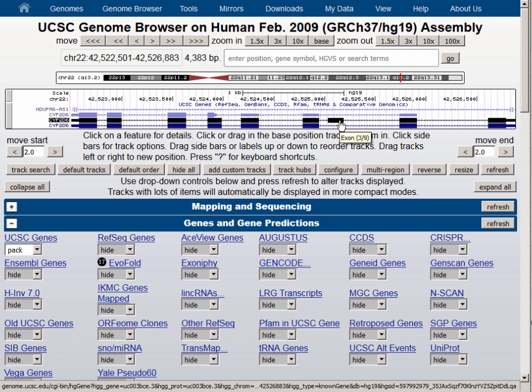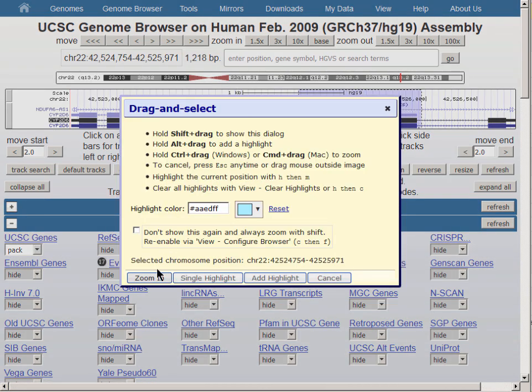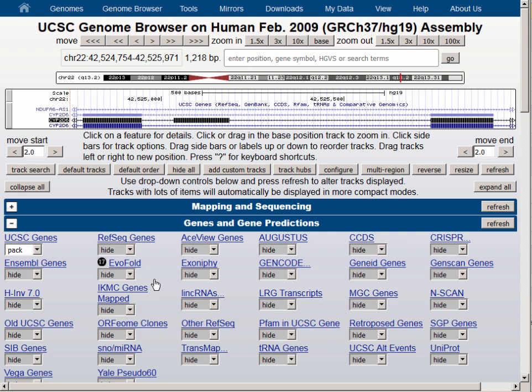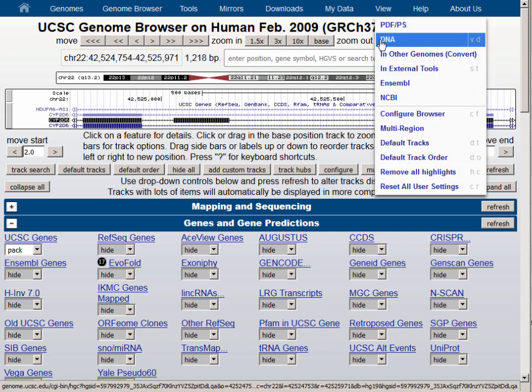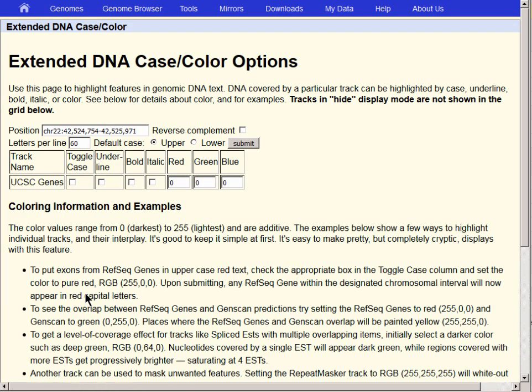Let's zoom into the three exons with the differentially expressed exon in the middle of the screen, and go to the View DNA pull-down in the blue bar menu to extract some DNA to use as primers. Extended case color options at the bottom of the screen allow us to use the UCSC Genes track to decorate the DNA output and make it more obvious where the exons are. Let's select lower case for the default so that we can toggle the case to capitals where the UCSC Genes track indicates the presence of the exons. We'll use 255 in the blue box in the RGB color selector so that the capital letters are blue and much more obvious, then let's submit.